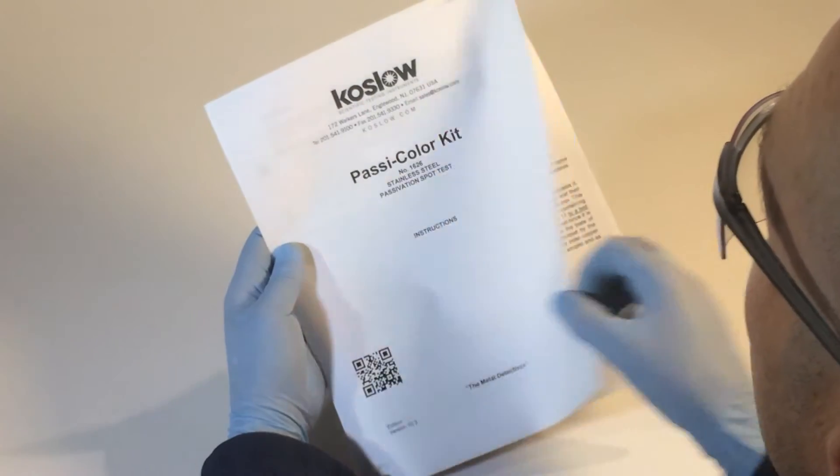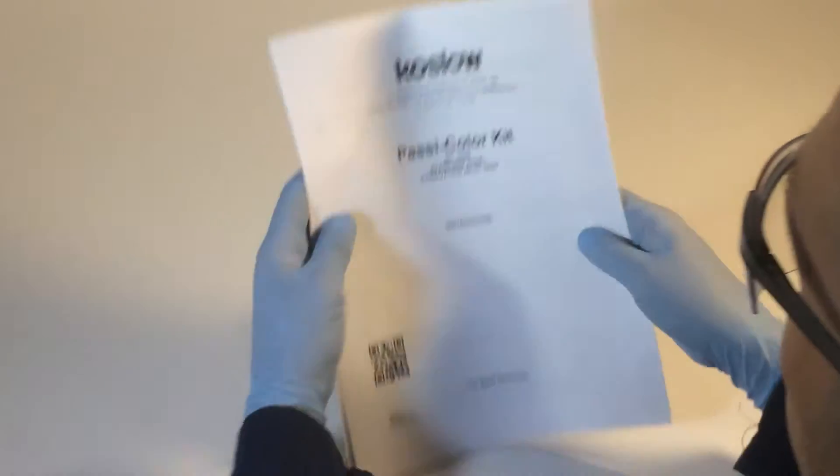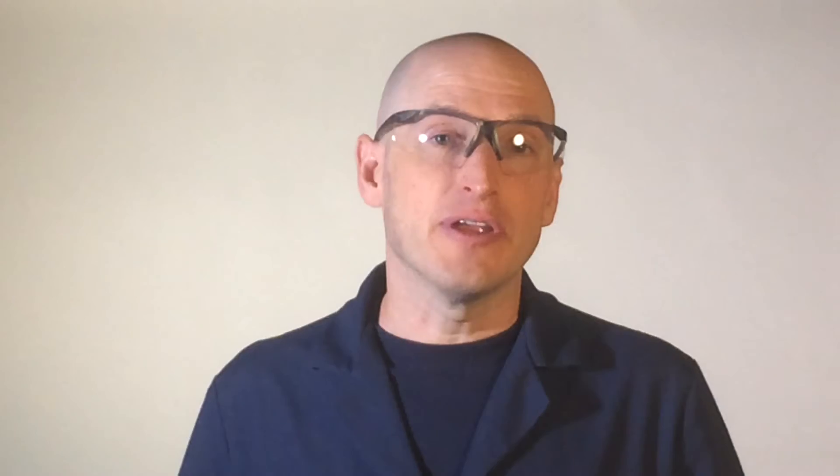Before you do any testing, be sure to read the instruction manual and check out the safety information. The use of eye protection as well as washing your hands when you're done is imperative.